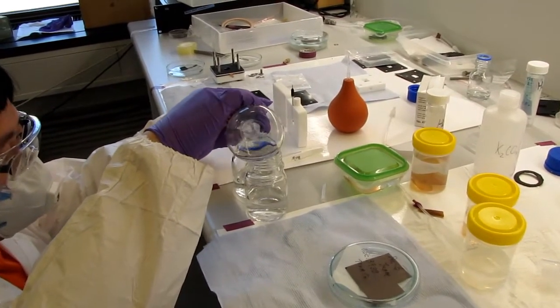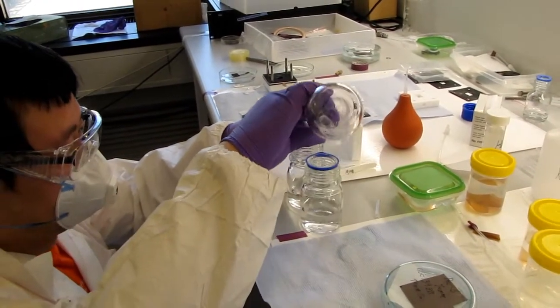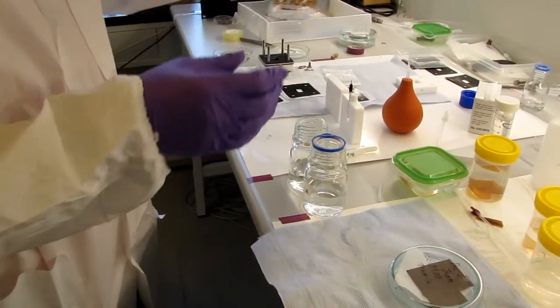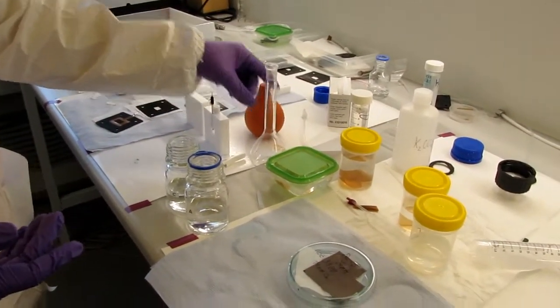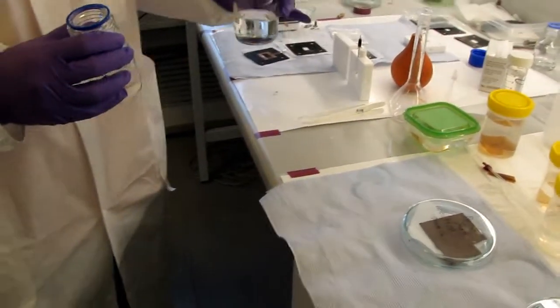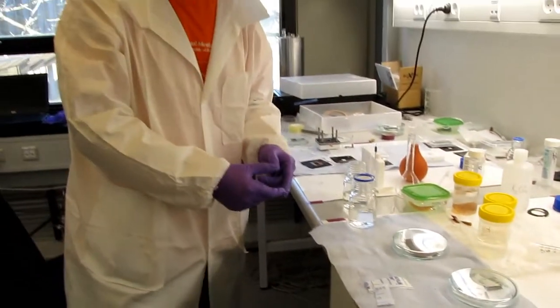Don't test the liquid products. I don't have to be so precise. Normally I have to use some tool to measure how much I fill in. After that I also have to measure again, otherwise you cannot know exactly how much electrolyte you have. That makes sense. Because every time after the experiment the electrolyte volume will change a lot.